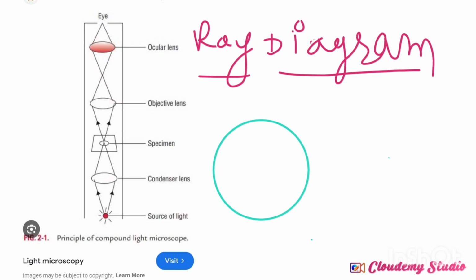We know that in bright field microscopy we use a stained specimen. Suppose we are observing rod shaped bacteria stained by crystal violet. When we observe this specimen in the microscope, we see violet colored rod shaped bacteria, and the microscopic field is brightly illuminated.